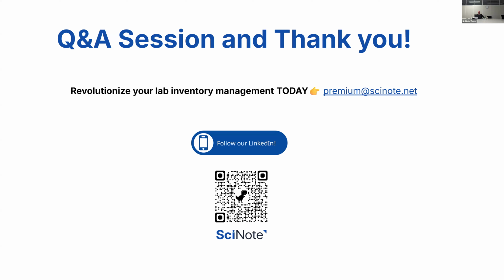Okay, good. Last thing before we finish off, another reminder. You're going to get emails anyway, but this was the first webinar of a three-part series. The second one will be a deep dive into more advanced features. Looks like it's going to be custom labels and stocks, if I remember correctly. And the third one will be a webinar with one of our customers that uses SciNote on a daily basis in a bigger team.